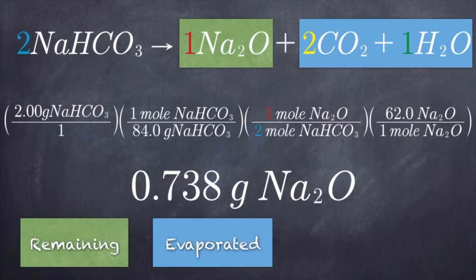The next one is baking soda breaking down to sodium oxide. And so we have another balanced chemical equation, and this one breaks down to sodium oxide and then CO2 plus water. So in this one we get water vapor, which is different, that's unique.